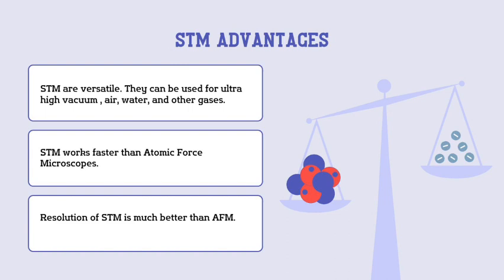STMs are helpful because they can give researchers a three-dimensional profile of a surface, which allows researchers to analyze a multitude of characteristics, including roughness, surface defects, and determining things about the molecule size and conformation. It is capable of capturing much more detail than other microscopes. This helps researchers better understand the subject of their research on a molecular level.